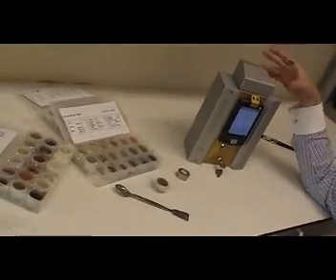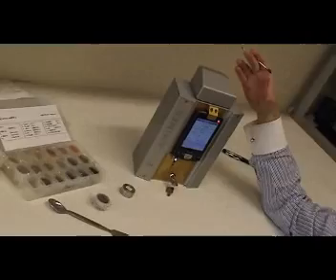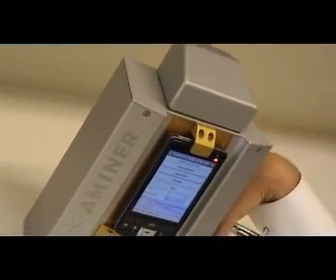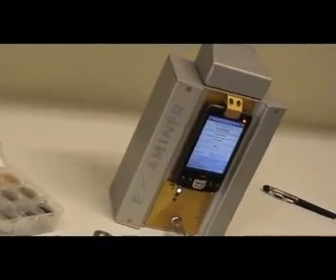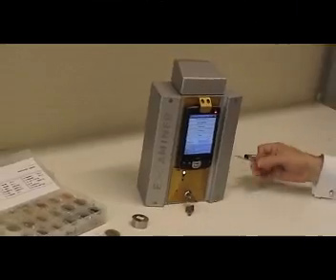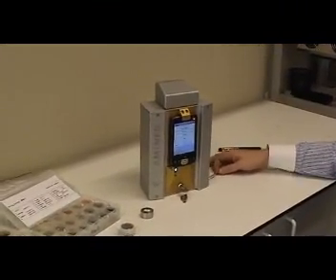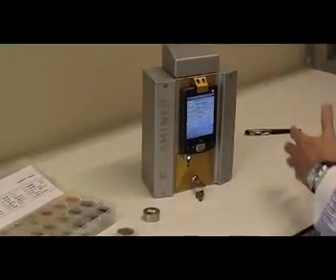What we see here is the world's first portable benchtop analyzer. It's only 2.4 kilograms with a battery lifetime of 20 hours. We see it's not connected to any computer at this moment or to electricity. However, we can connect it to electricity or to the USB port to the computer where you can have more extended calculations and so on.